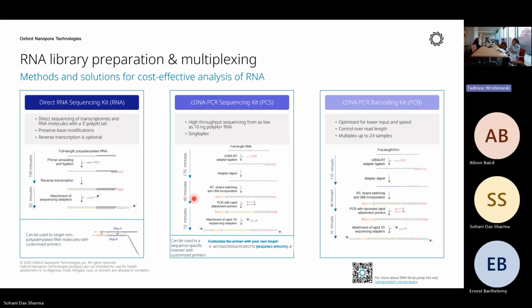First of all, I don't think we have any benchmarking data for microRNA sequencing to support anything. But I know that a few labs are trying to optimize it. If you are really interested, I can explore it. Theoretically it is possible. You can do polyadenylation and use this platform.